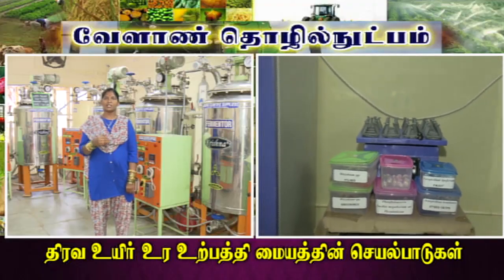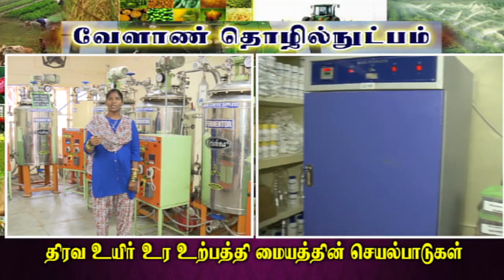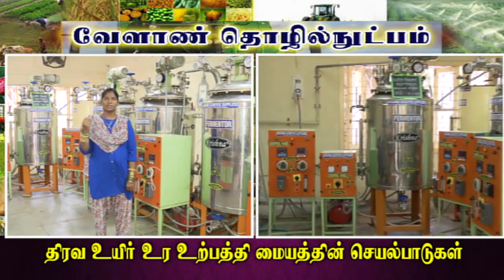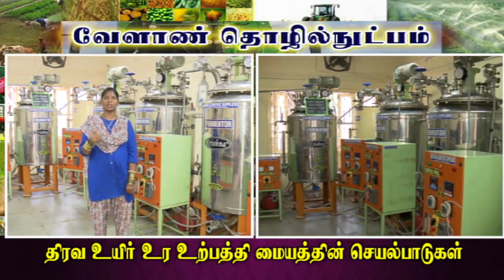In the lab, there are instruments being used for production. There are slants, and media is made ready. Media is prepared on slants. There is a BOD machine in which growth occurs. This is how the bio-fertilizer growth is initiated.